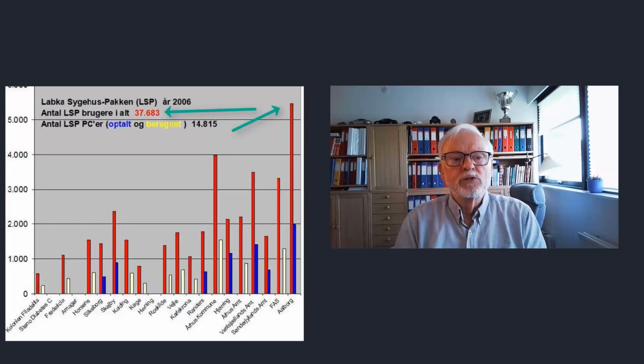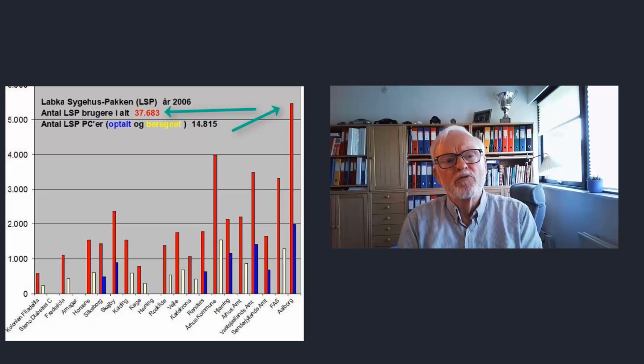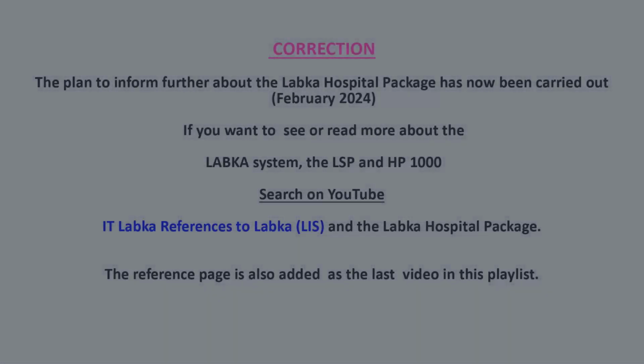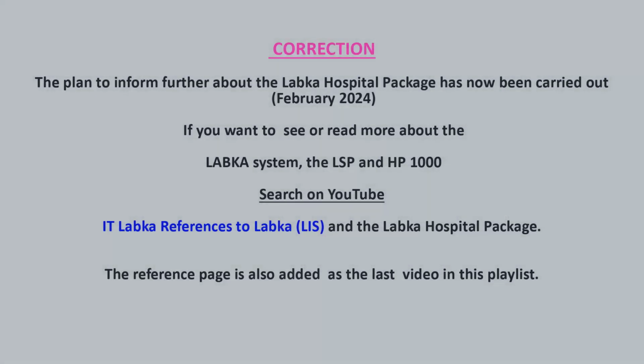I have only planned to talk a little about the LSP later. Also, in LSP we had a focus on flexibility and real time, and I have very nice instructive LSP videos from '98. More about the Labka system. You can follow the guidelines written here. It is a much more comprehensive description of the Labka system.